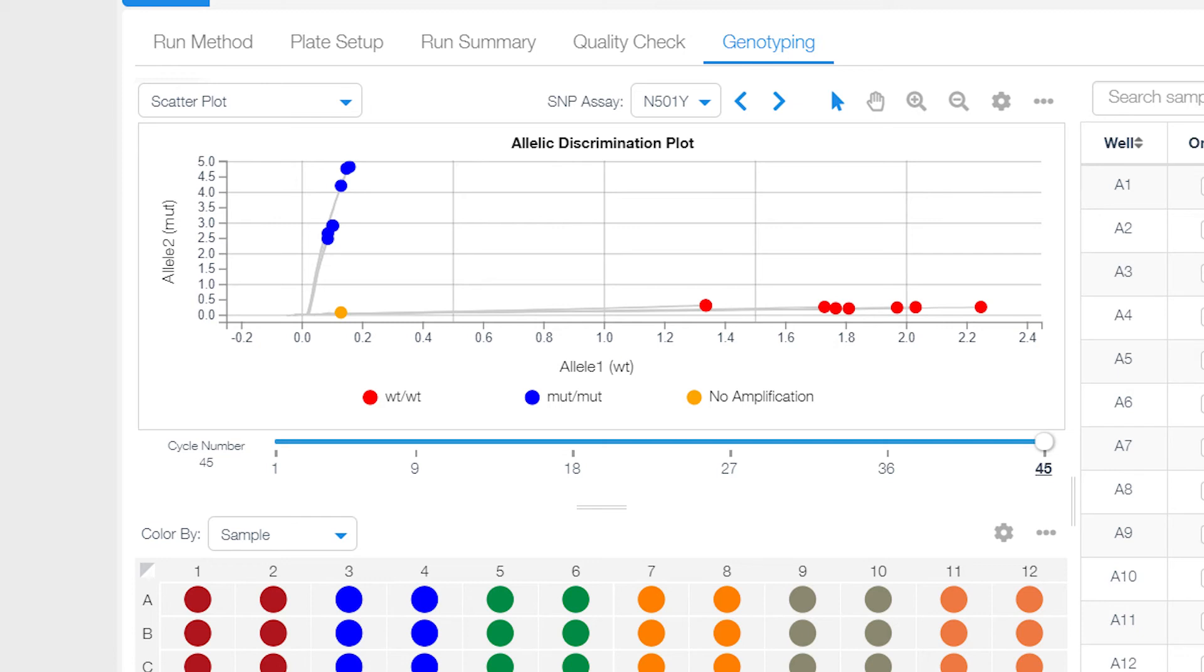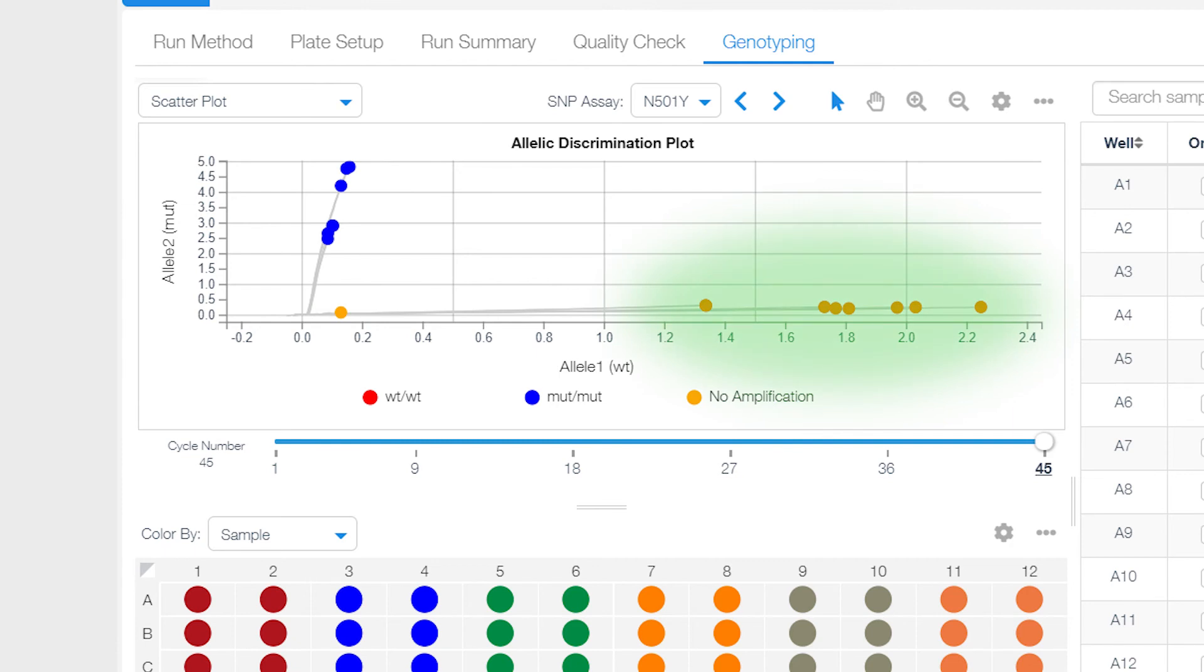All the samples investigated that have the N501Y mutation have clustered along the Y-axis, shown here in blue. All the samples that have the wild-type or reference sequence have clustered along the X-axis, shown here in red.